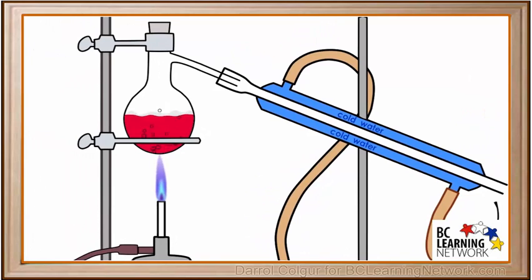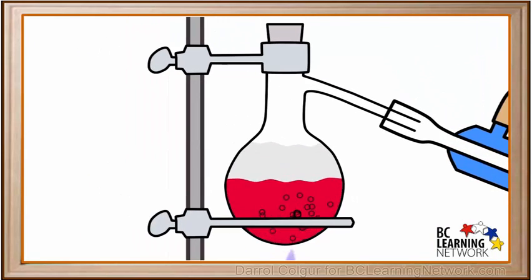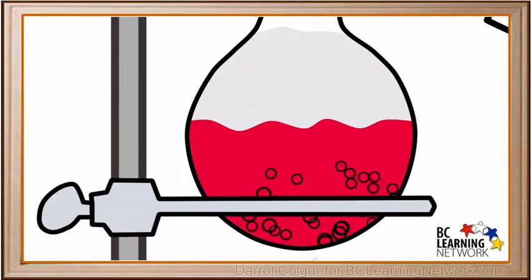After we start the Bunsen burner and heat the flask up to 100 degrees, the mixture starts to boil. We'll zoom in closer.